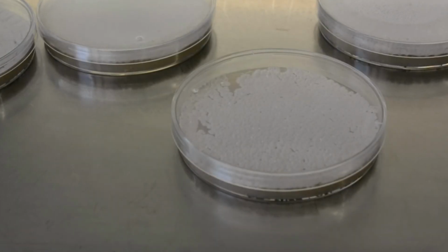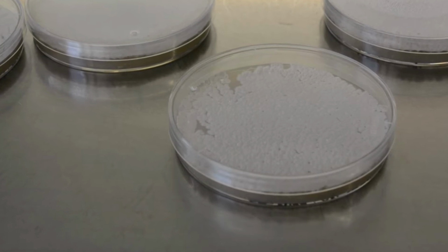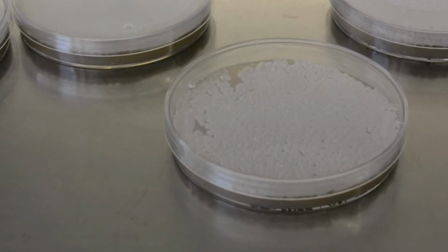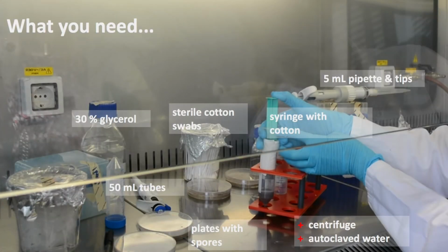Once the first colonies of Streptomyces start to grow and reach a certain size, they start to produce spores, which can be seen by darkening of the white colonies. When the plates are light gray, spores can be harvested. We will show you how this can be done and what you need for the procedure. First of all, you need plates with spores, sterile cotton swabs, 30% glycerol, 50 ml tubes, 5 ml pipettes and tips, a centrifuge, and autoclaved water.